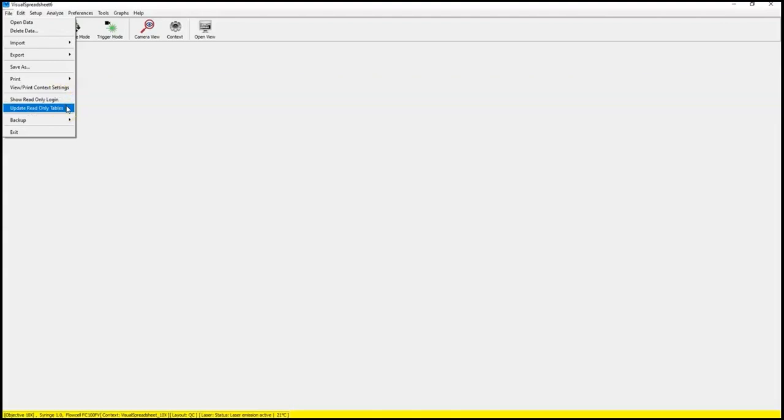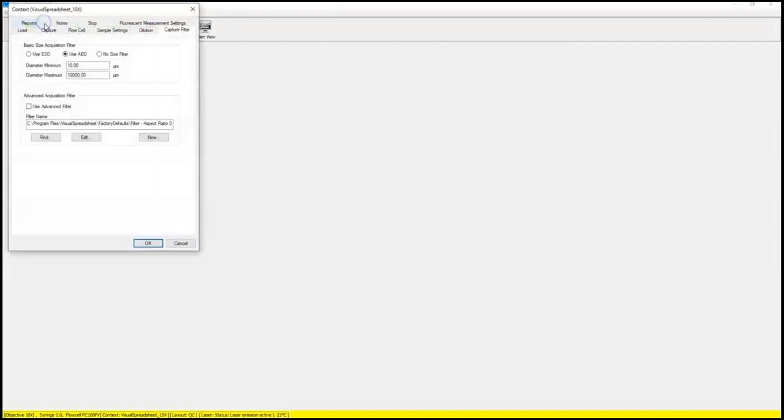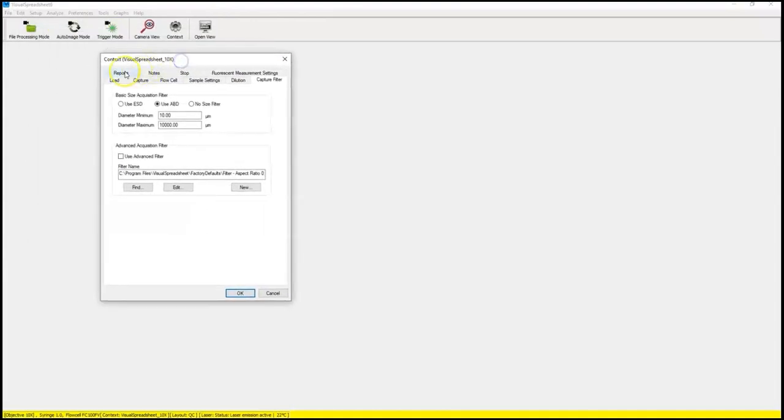the primary data. From an open run, you can select particles and then go to the Edit menu to either remove those selected particles or remove the particles that are not selected. The Setup menu allows you to access the context window, which contains several tabbed pages where you can input the flow imaging microscopy conditions for your sample.